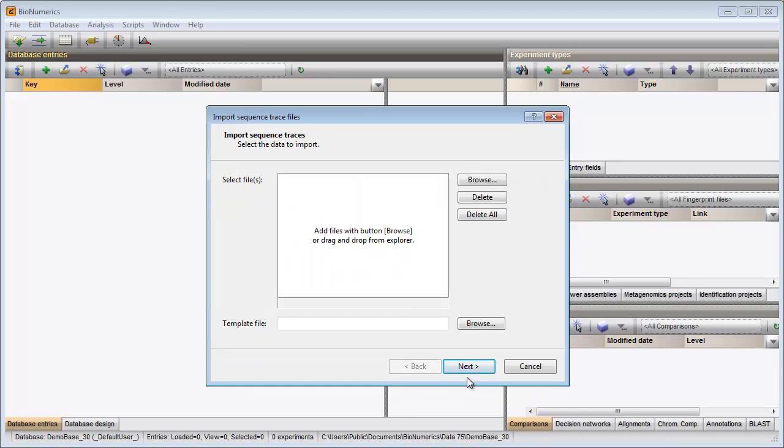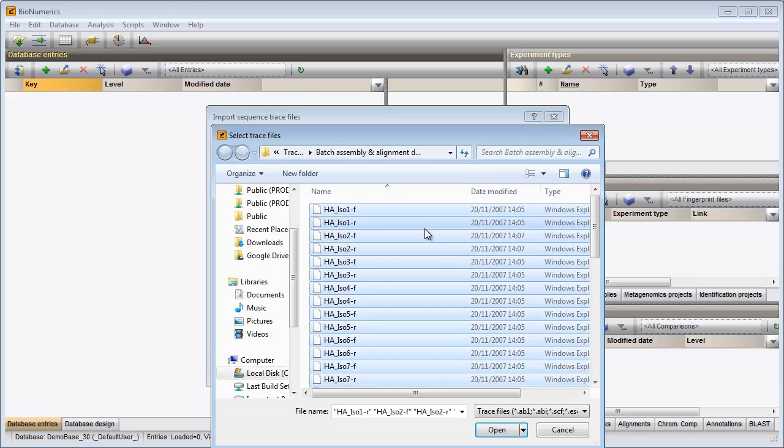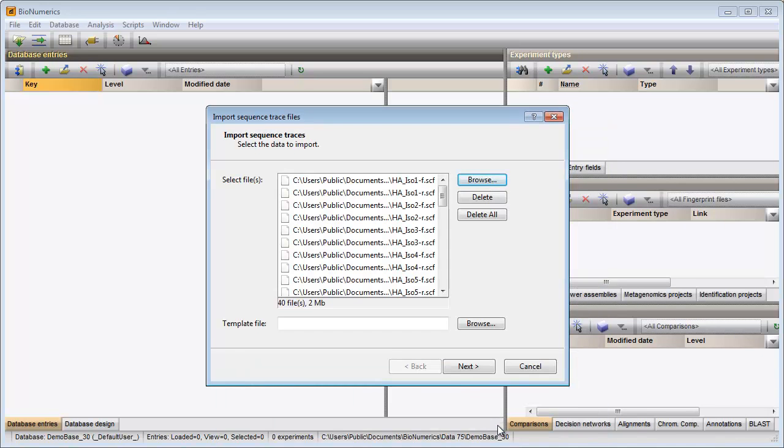In the first step I need to browse for the files. I select my files and click open. All files are displayed in the input dialog.